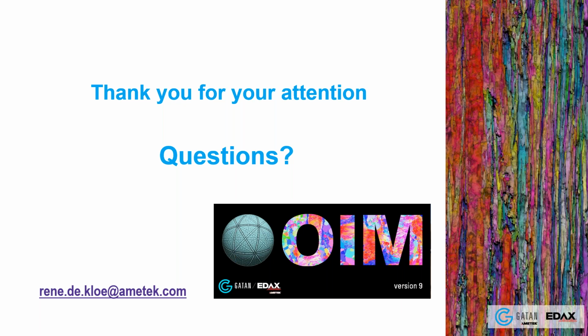The caveat here, be careful: EBSD cleanup I often describe as in situ grain growth experiments in your computer. Be very careful when you do that. But when you know there are just a few separate pixels along boundaries, you can do a dilation or one of the other cleanup tools to touch the grains together. That will allow you the best possible reconstruction. So there I would do a little bit of a cleanup.